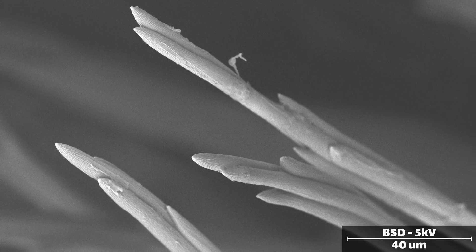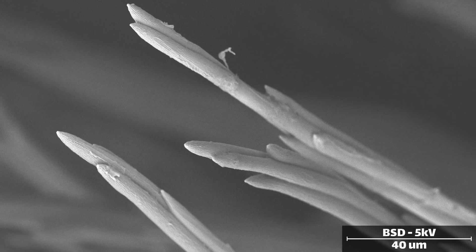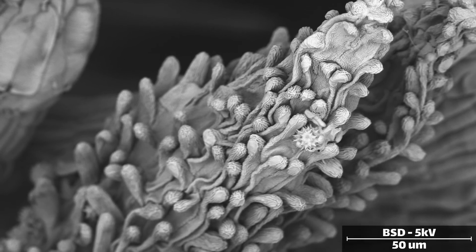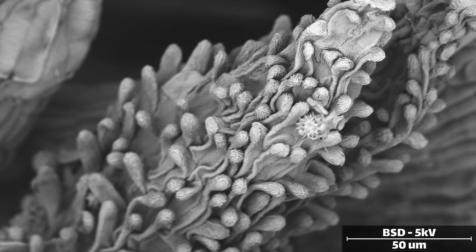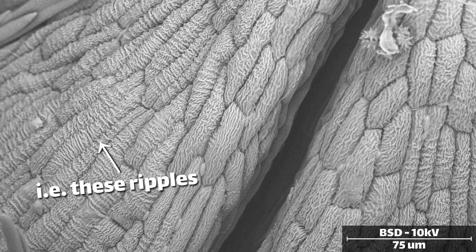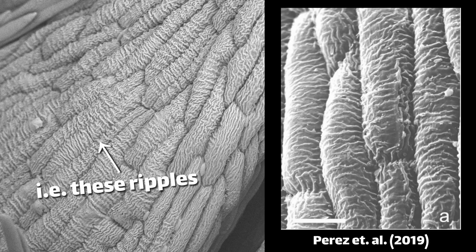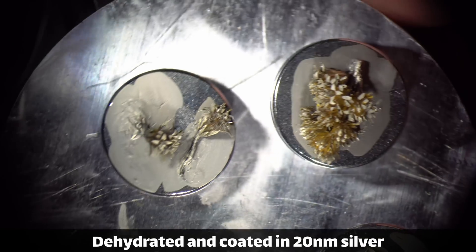Now might be a good time to talk about artifacts in scanning electron micrographs. In many of the images seen today, there's a deflated or crumpled look to the various parts of the plant. While this might be an accurate depiction of some structures, like the backside of the petals, which as far as I can tell really do look like this, other areas are definitely unintentional artifacts.